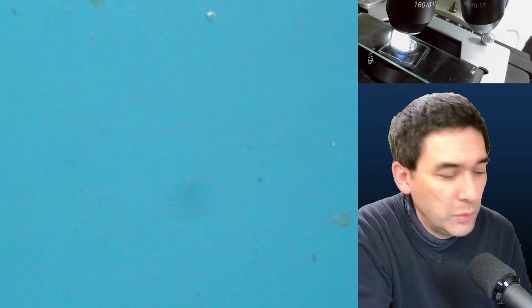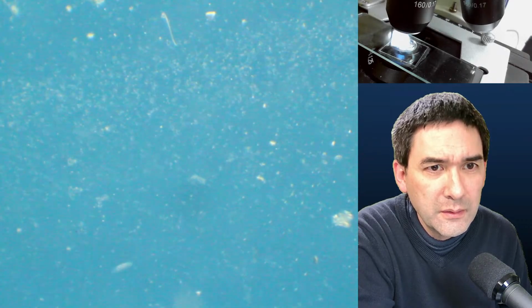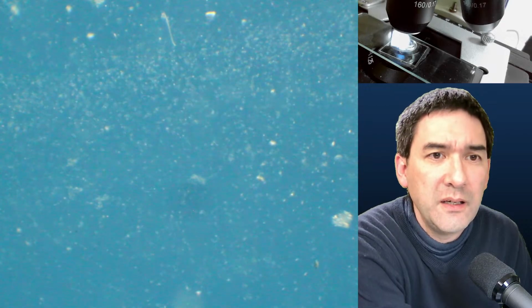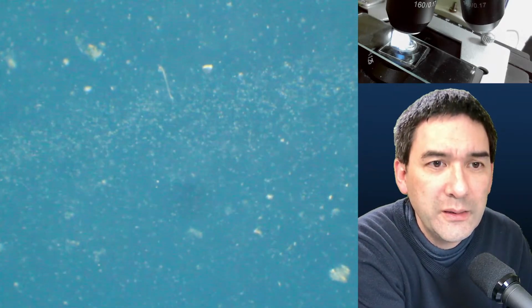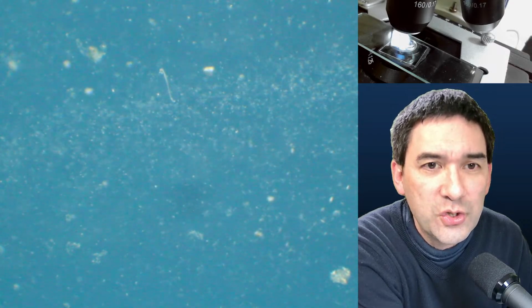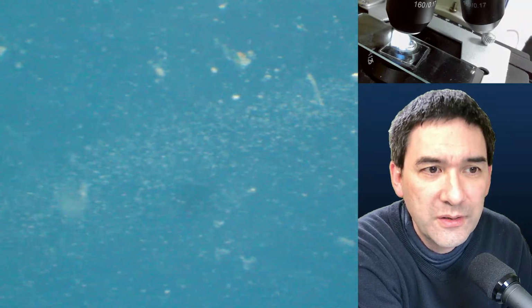Again, I'm going to change now the filter. So I'm putting in the blue one now. And that's now the blue one. Yep. So it also looks a little bit better, because there is now less contrast. So we do not see the disturbing fuzziness of those bacteria that are out of focus.